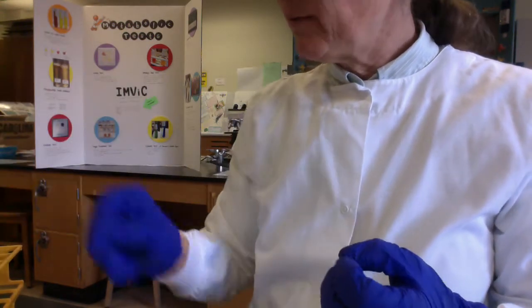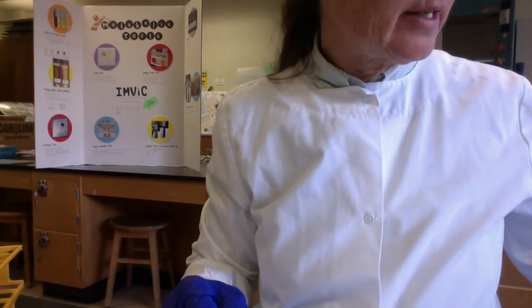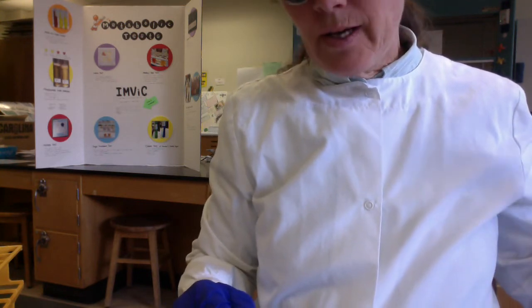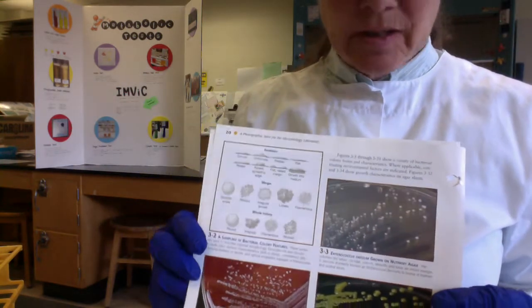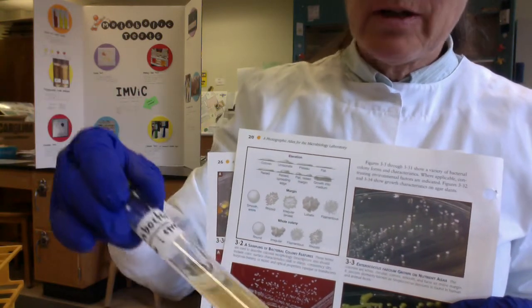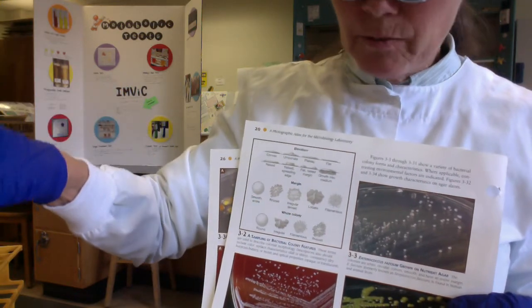All right. Now, folks, one thing I forgot to do when we were looking at the airborne plates, usually what we do is we introduce you to ways to describe different types of colonies, right? And this is best done when you're using agar plates. On a slant, very often the colonies aren't isolated, so it's hard to distinguish them.